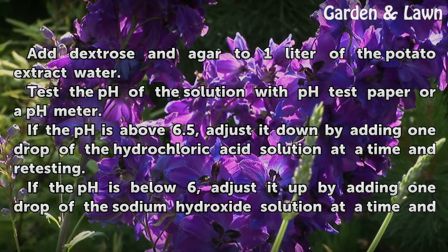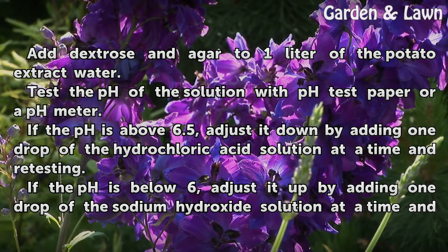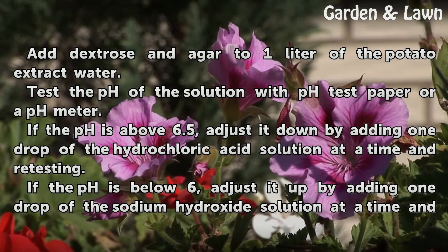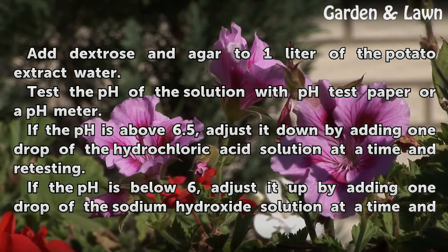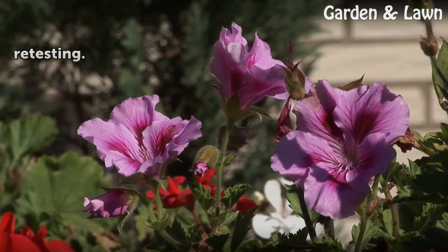Add dextrose and agar to one liter of the potato extract water. Test the pH of the solution with pH test paper or a pH meter. If the pH is above 6.5, adjust it down by adding one drop of hydrochloric acid solution at a time and retesting. If the pH is below 6, adjust it up by adding one drop of the sodium hydroxide solution at a time and retesting.